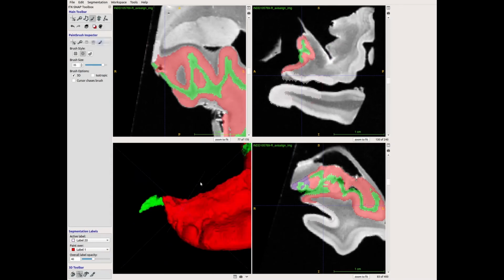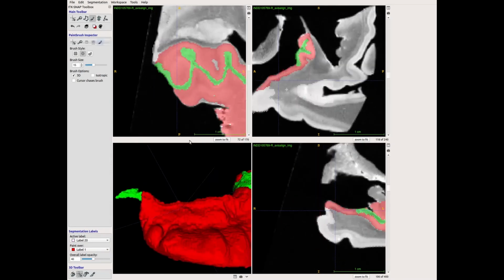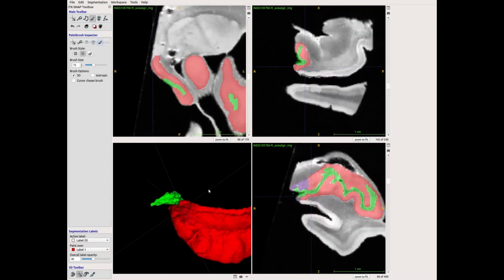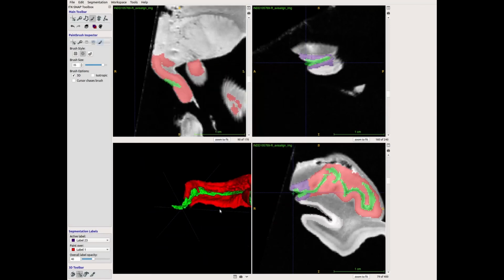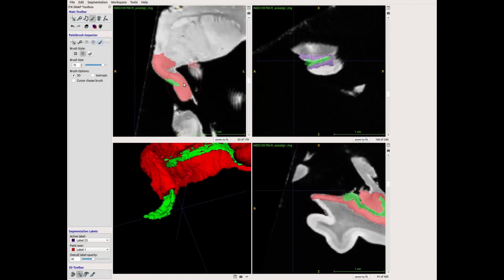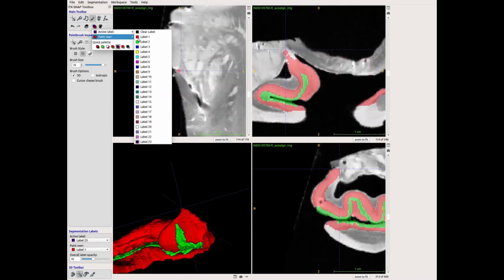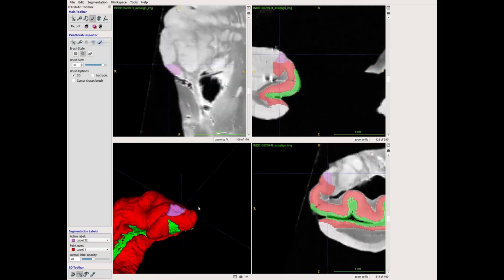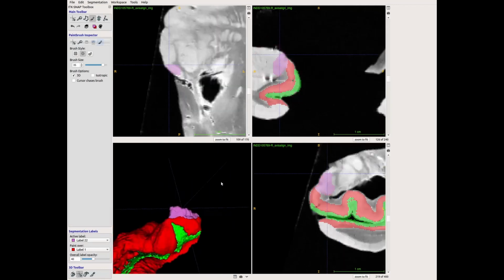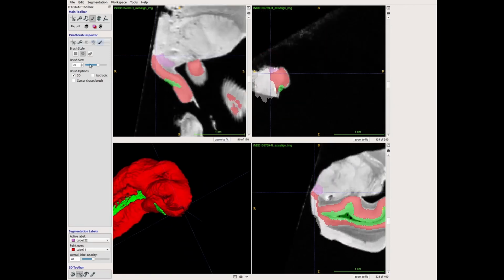Here I'm using a purple label, again, using a similar sort of heuristic where in the posterior of the hippocampus, I'm just relabeling it with this purple label. It's transparent on the 3D model just so you can see sort of where I've left hippocampal gray matter label. But basically, the rule is I'm taking off where the hippocampus starts to curve. So it curves medially, and then there's some tissue that curves upward. And so I've basically tried to take off the very posterior tip that curves upward.